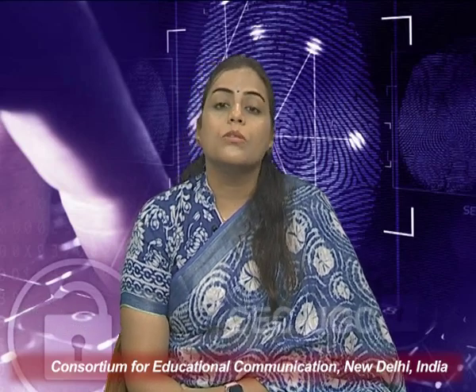Nowadays the ultra high force centrifuge can go up to around 75,000 rpm with a relative centrifugal force of up to 5 lakh Gs. Swedberg coined the term ultracentrifuge. He was a colloid chemist. He used it to determine the molecular weight and subunit structure of hemoglobin, studies that changed the ideas concerning the structure of proteins. The first commercial ultracentrifuge was produced in the year 1940 by a company called Spinco.